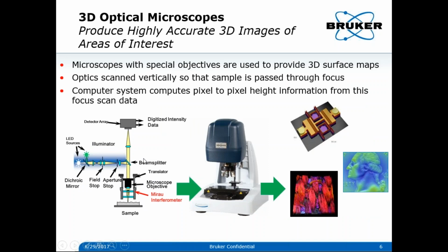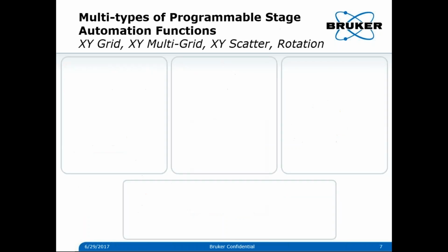And if we integrate an interferometer into a microscope, we can magnify small things and then measure applications such as roughness on the surface. We can also measure step height, even textile. So after measuring and capturing the images, you can use the standard Bruker Vision64 software, or for an old system, you can use the Vision32 version software to do the analysis.